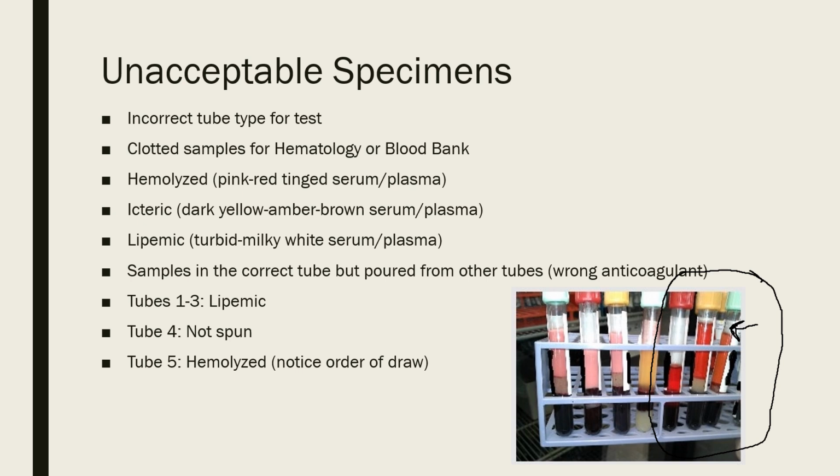So that's another consideration, is if a specimen is collected on an infant to do a bilirubin test, you've got to prevent that sample from being exposed to light. So putting it in something like a dark container to shield that specimen from light is very important, because if you're falsely breaking down those bilirubin particles inside that specimen due to light, and you test that specimen, you send it out, and it looks normal, but they're really elevated, then that infant's not going to get the treatment they need. And what can happen over time is that bilirubin actually damages the brain.